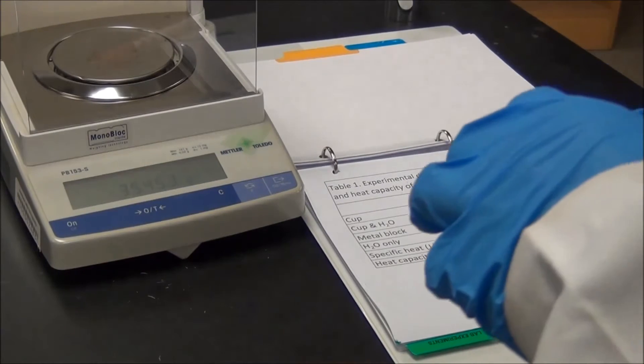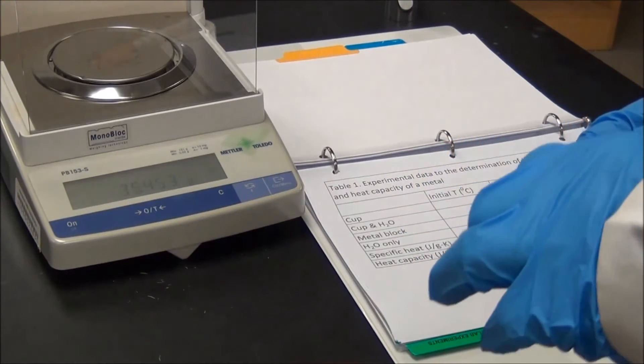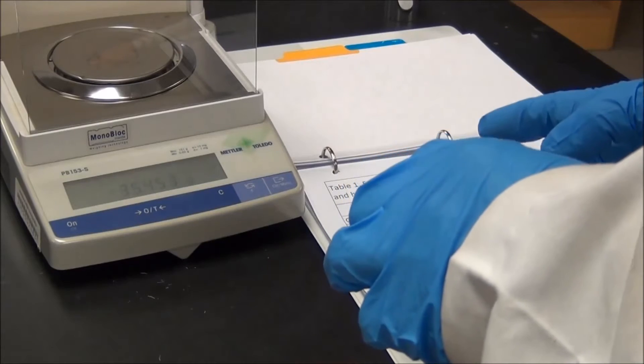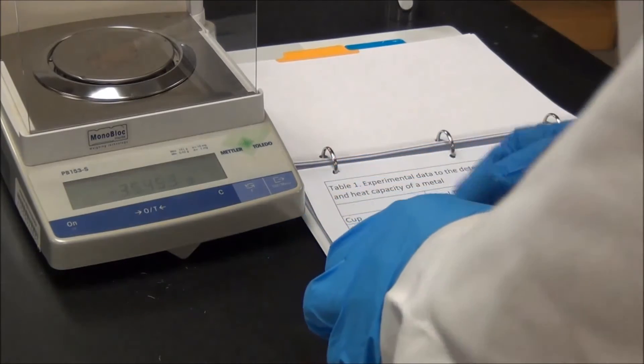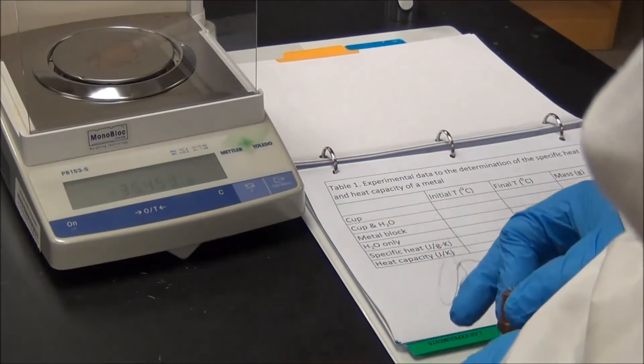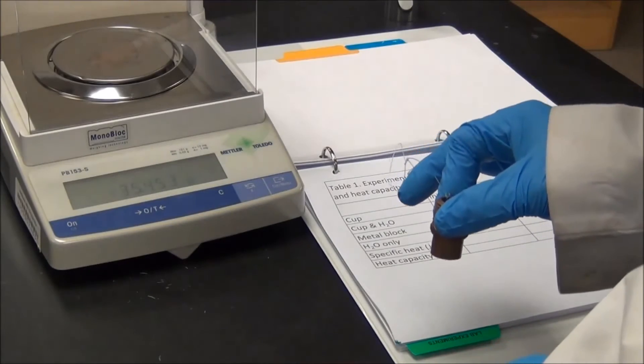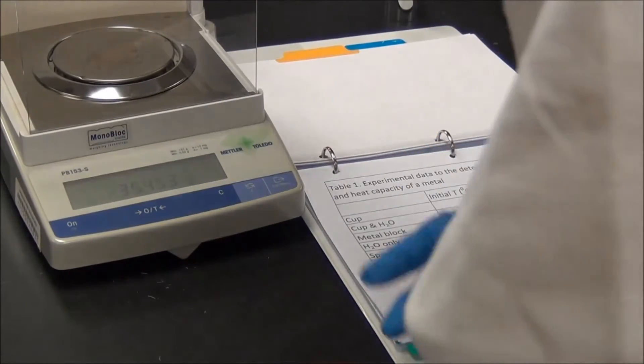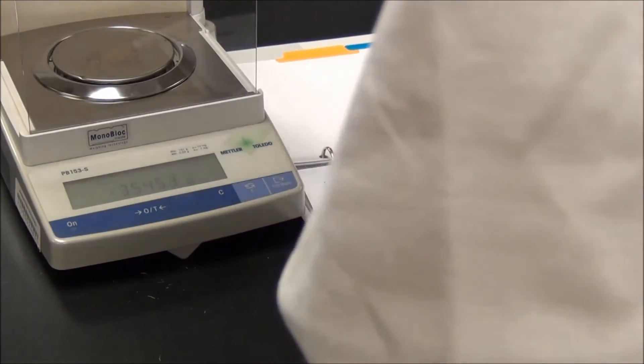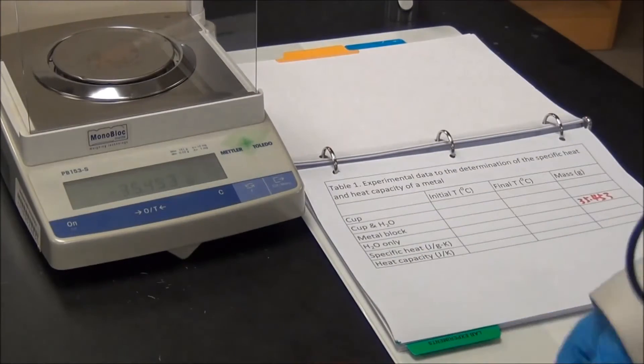Sometimes when you find a balance, it is already on. And in this situation, you must pay special attention to the initial reading before you place any object on top of the balance. Let's look at this one. The reading is negative 35.453 grams.